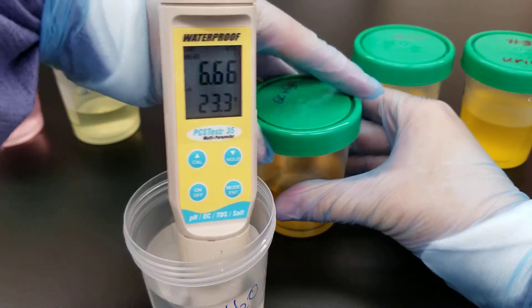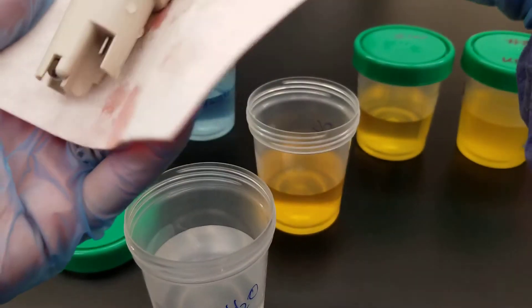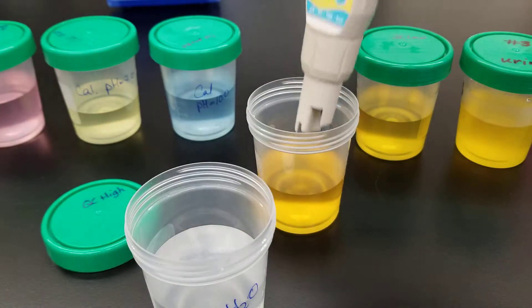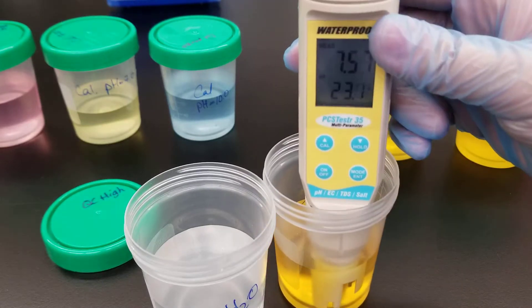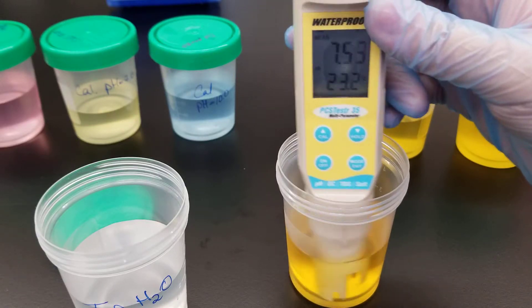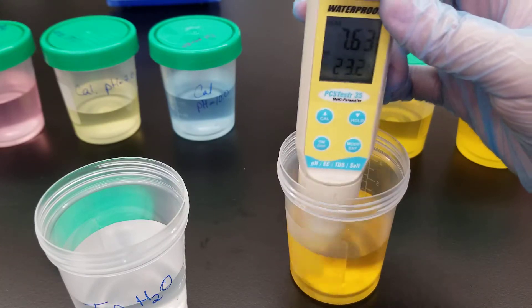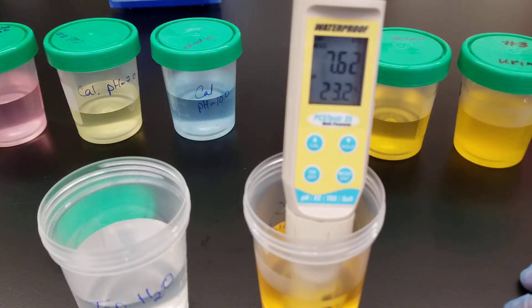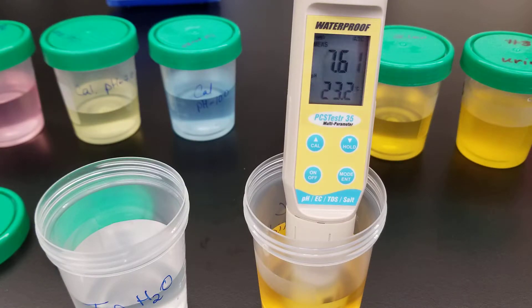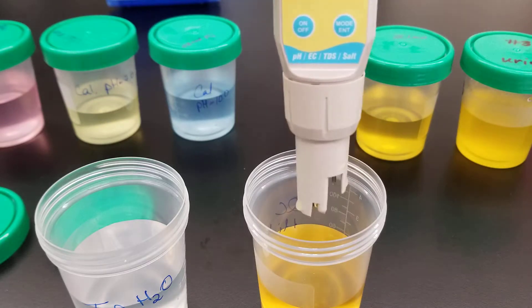We're going to swirl the QC, wipe excess off, and put the probe into the high QC. We make sure to submerge the probe and swirl it. Now let it sit and stabilize. The high QC reading is 7.61.